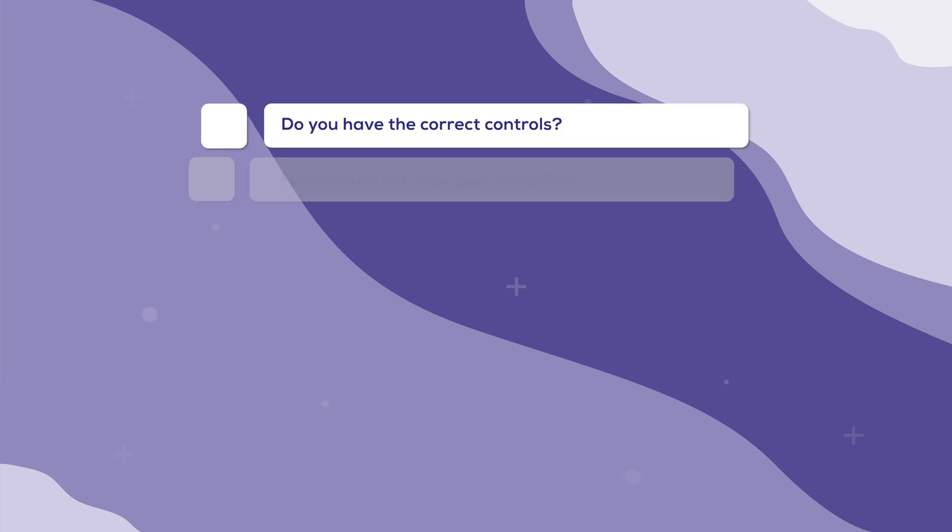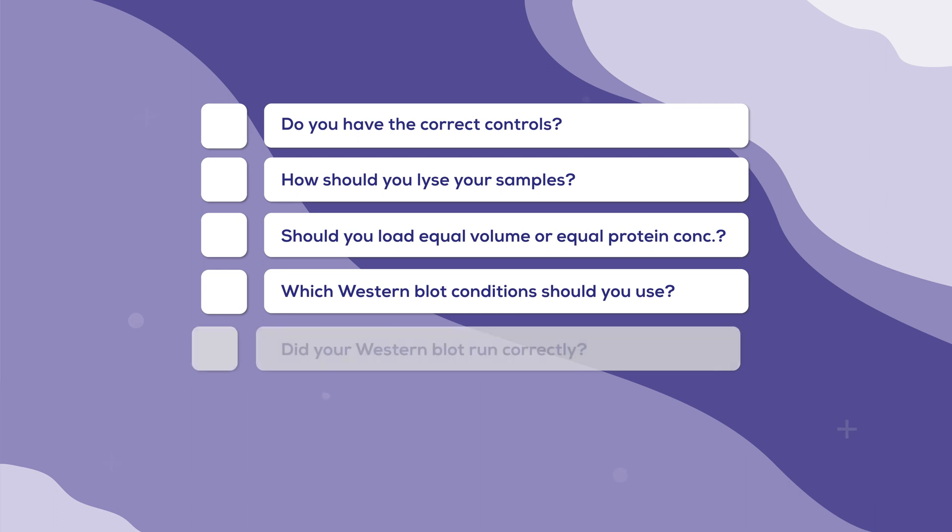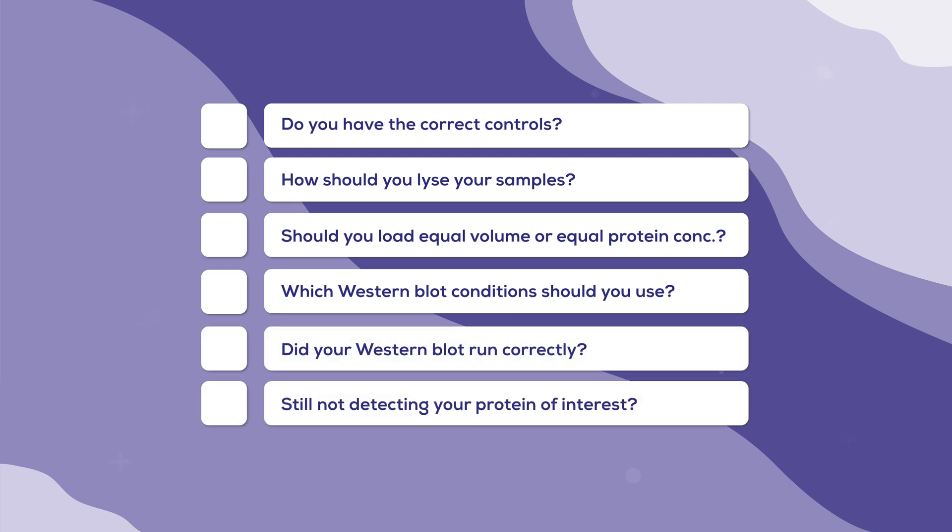Today, I'll cover controls, lysis, loading strategies, Western blot conditions, evaluating your blot, and what to do if you are still having issues. So let's get started.